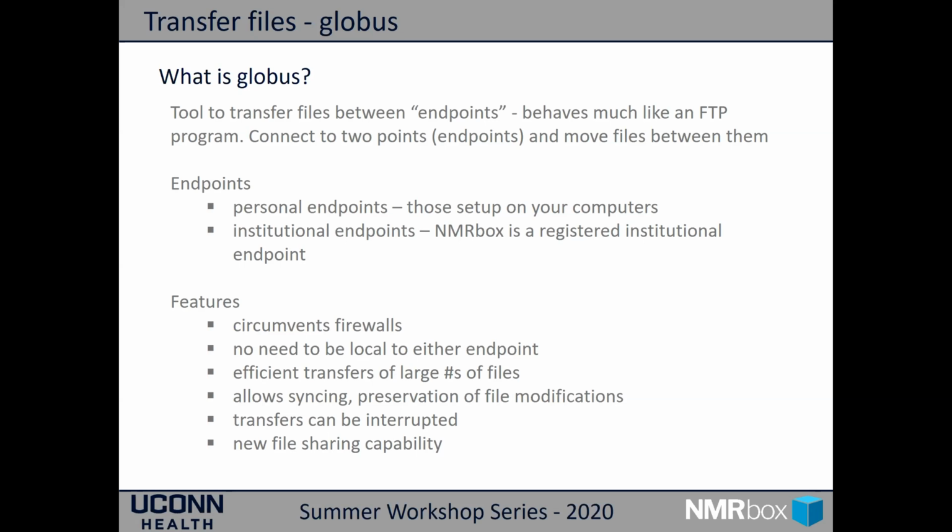So I could have an endpoint running on my home computer, I could be on my work computer, and NMRbox could be an endpoint. From my work computer, I can connect to my NMRbox endpoint and my home computer endpoint, even though my home computer is not generally accessible over the network, but through Globus it is.